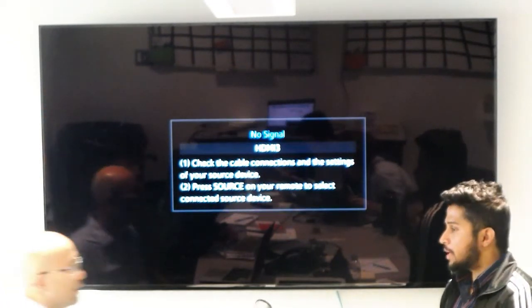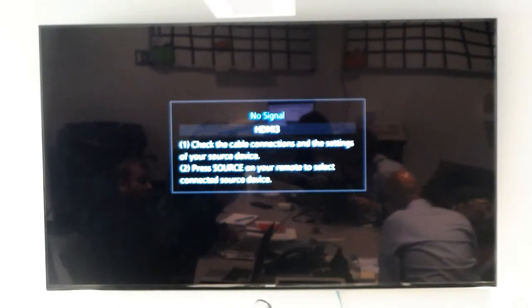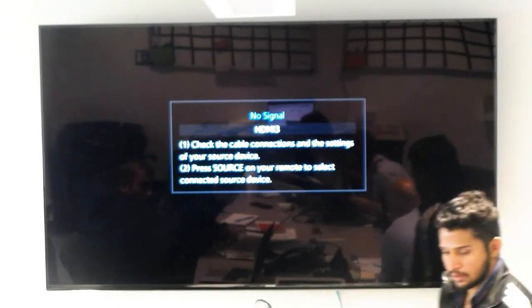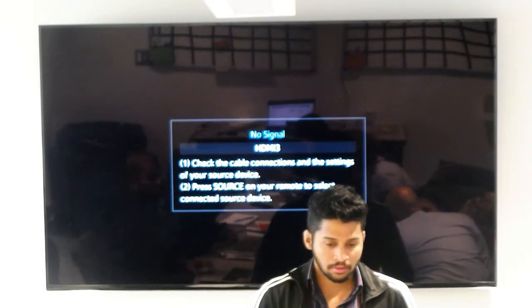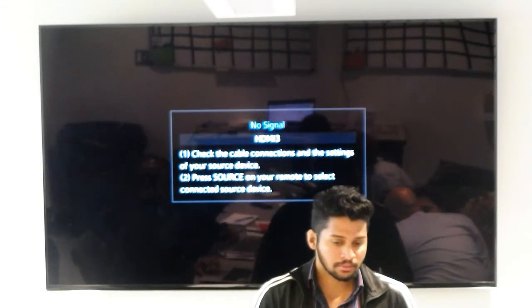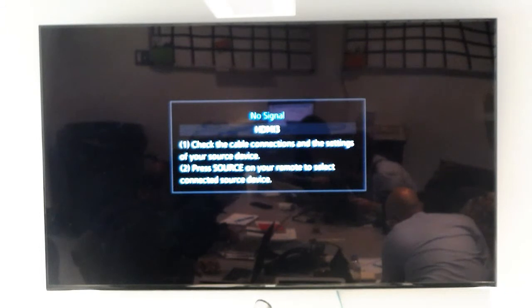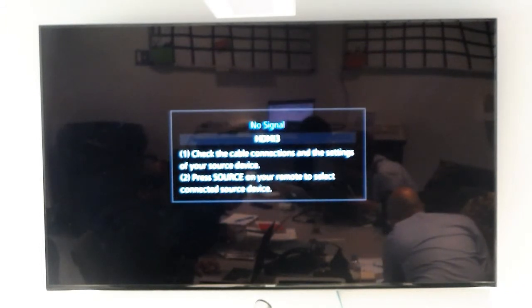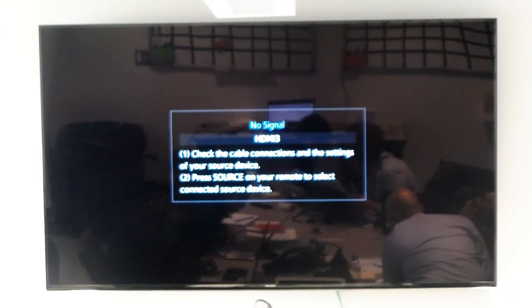It says MPI, I think, but I checked the instance. It has MPI. It has MPI. So you don't have MPI. You don't really have MPI. So you can't even run CPU acceleration. No, it has. It has MPI. Okay, let's see. Let's say we did this. We did no. Will this run?